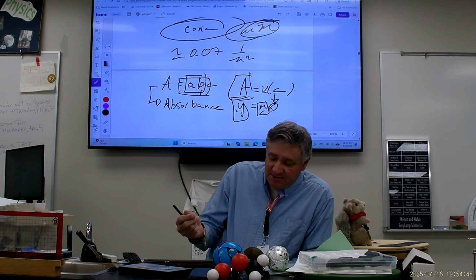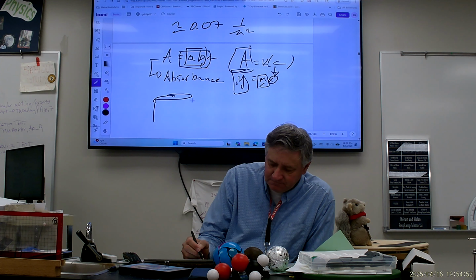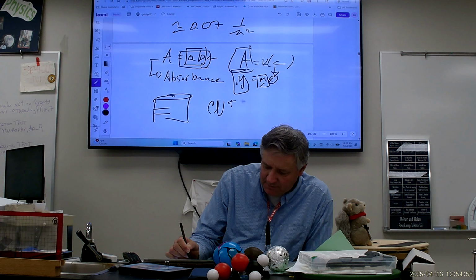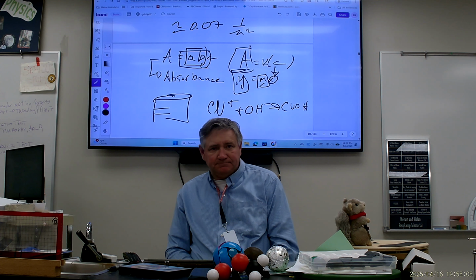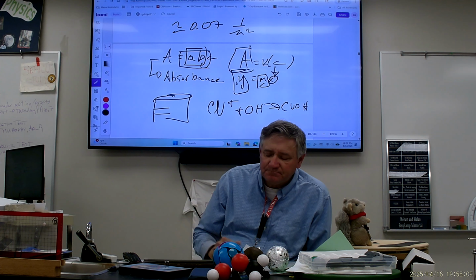So today, here's what you're going to do. You're going to take some crystal violet, and you're going to react that with some sodium hydroxide. There are a couple of cool things about this. One is that the reaction takes place pretty slowly. It isn't like we mix them together, bam, the reaction is done. This takes a while.